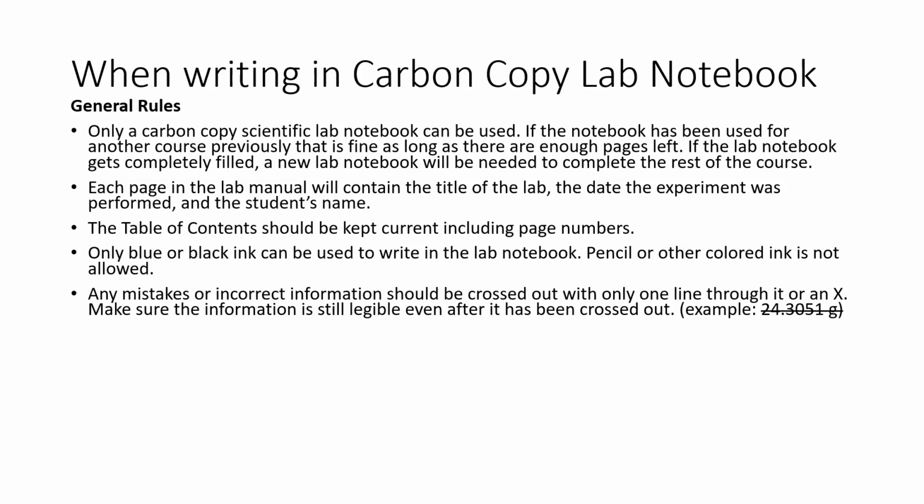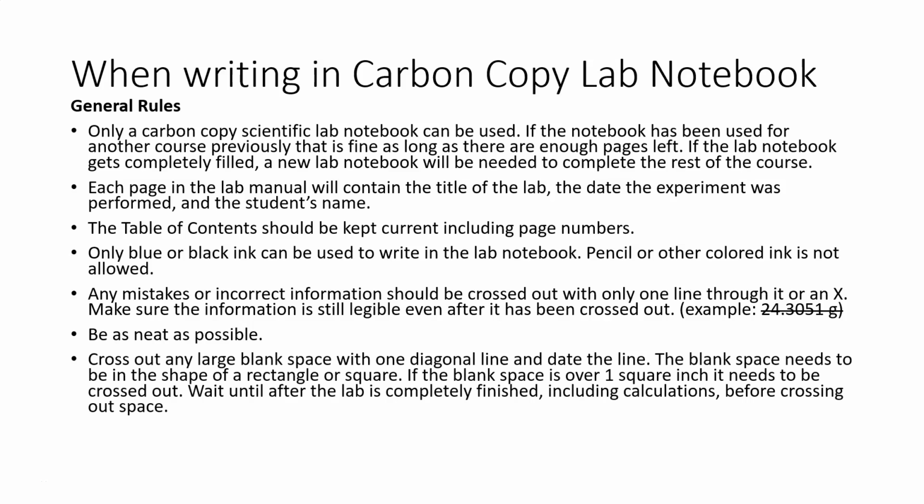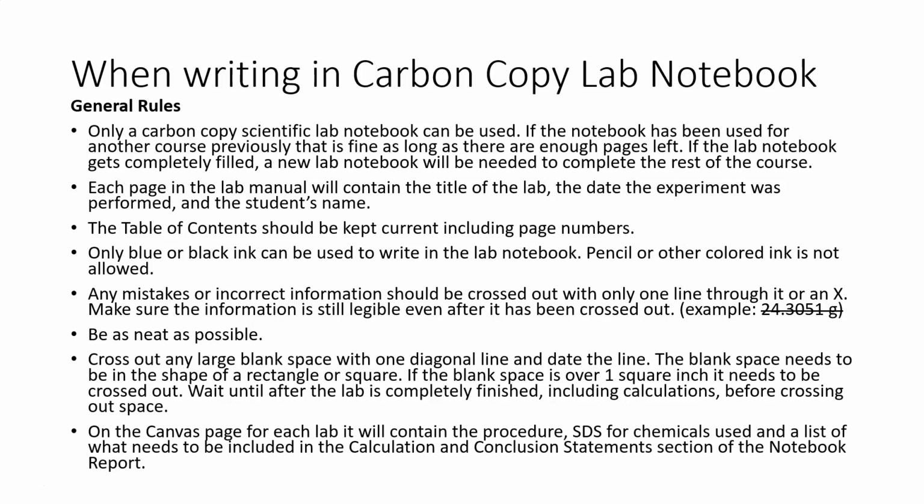We can't erase and you can't scribble through something because then it looks like you're hiding something. Be as neat as possible because people are reading your notebook. At the end of doing a lab and completing all the information that you need to, any large blank space, so empty space on any of the pages that's at least 1 inch by 1 inch, needs to be crossed out with a diagonal line and dated. I'll show you that here in a second.